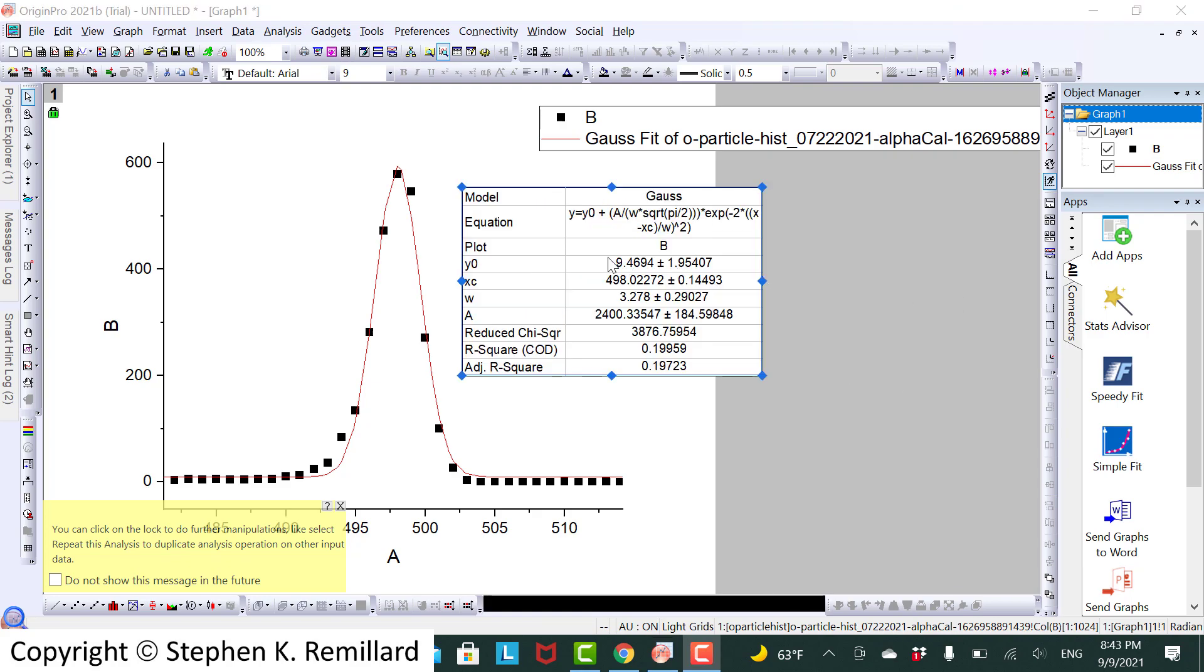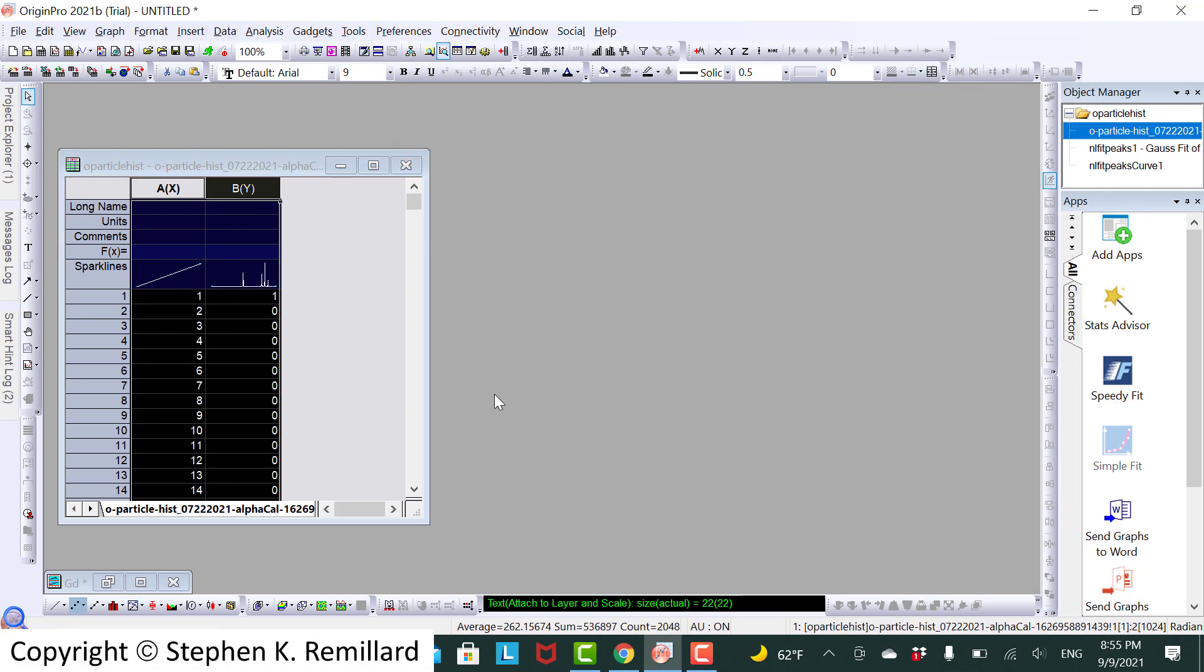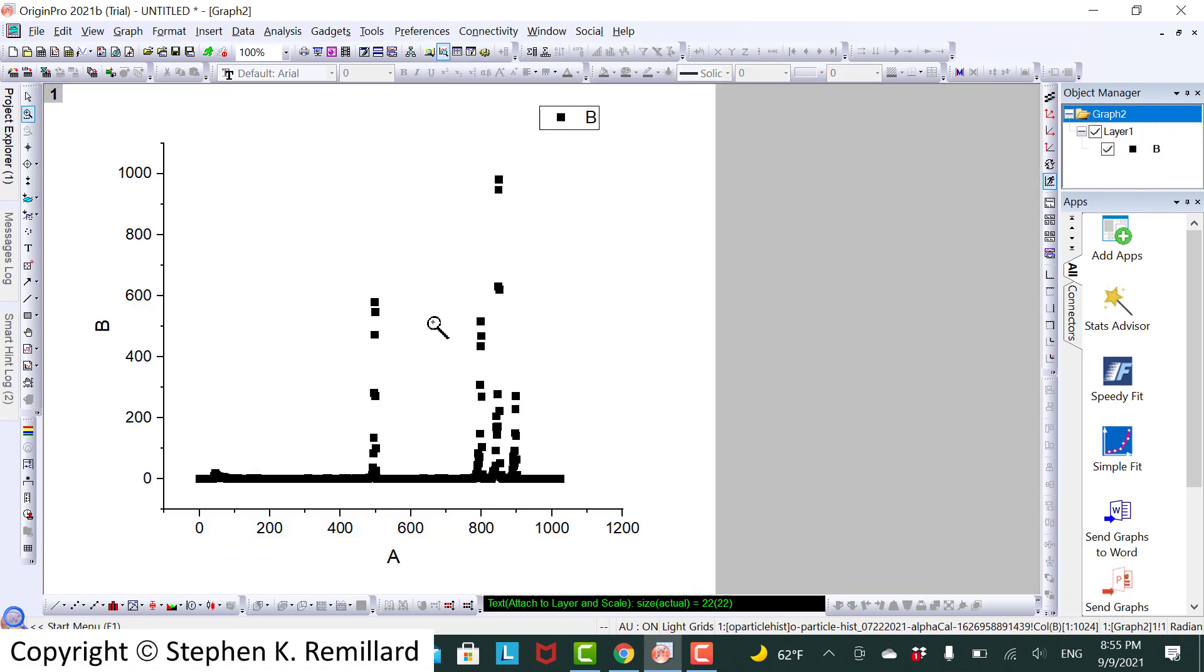The gadolinium peak is at channel 498.0227. Minimize that. To do the next one, plutonium, just do another graph. Zero in on the plutonium peak. And like I say, you can't really see the third peak.